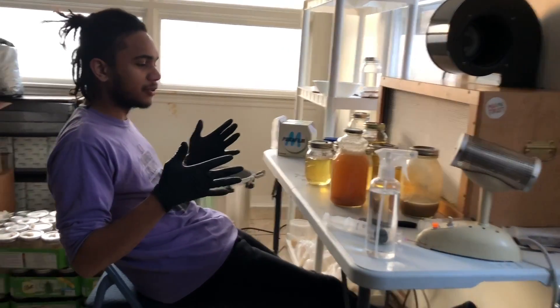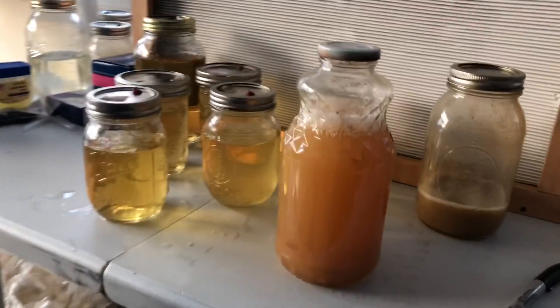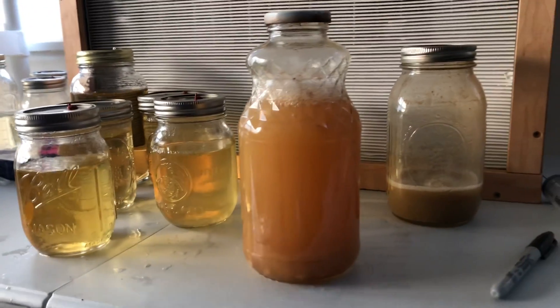Hey everybody, William B. Brown coming at you. We did the liquid culture prep in the last video. In this video, I'm going to show you what we do after we run through the pressure cooker or sterilizer.